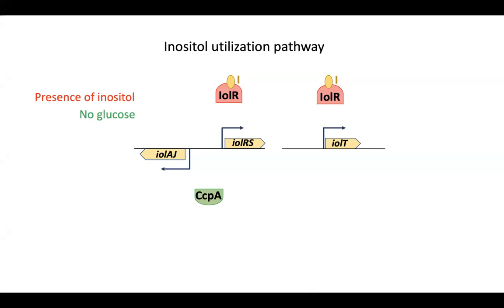We obviously cannot do our method without cross-linking or without fixing. So we tried a bunch of fixes that did not cross-link, but the cells are structurally not very sound and so we lose a lot of cells if we are not cross-linking. For eukaryotic cells, they can actually be fixed with methanol and you'll get the result, but formaldehyde was slightly better, if I remember correctly. For bacterial cells, for now, yes, formaldehyde. But we are exploring.